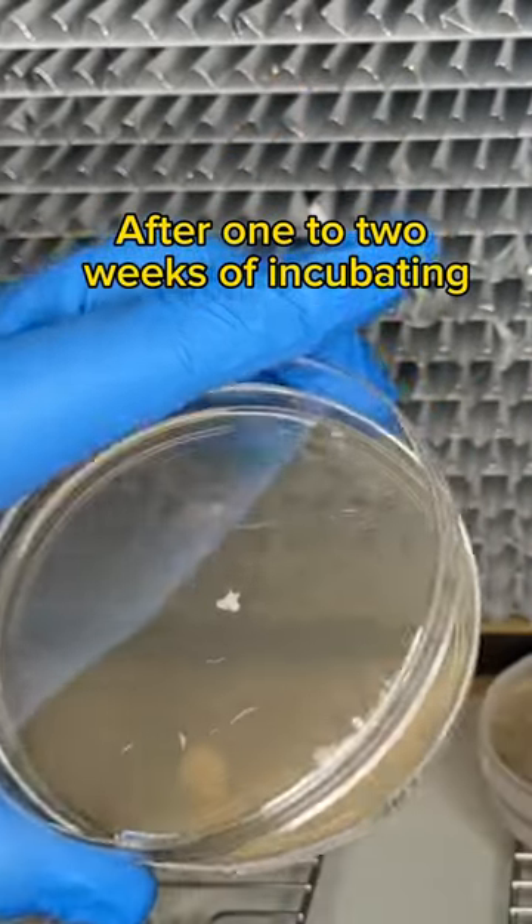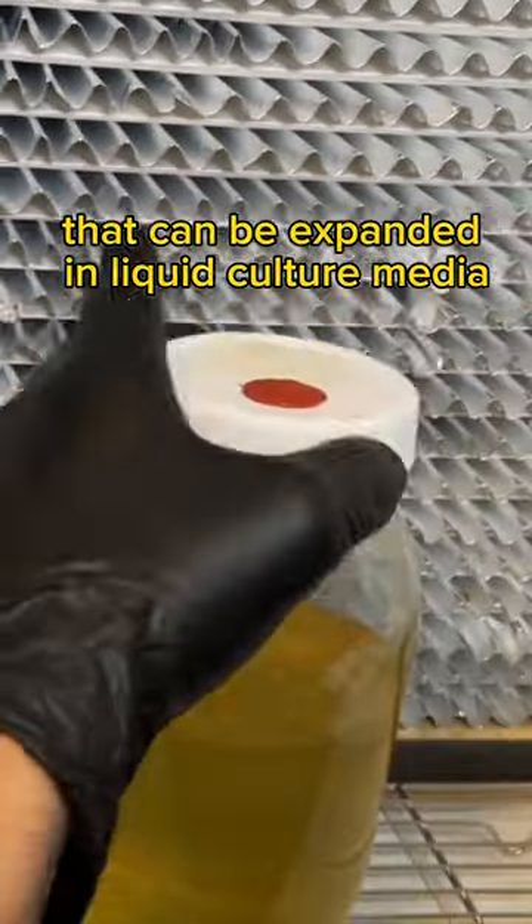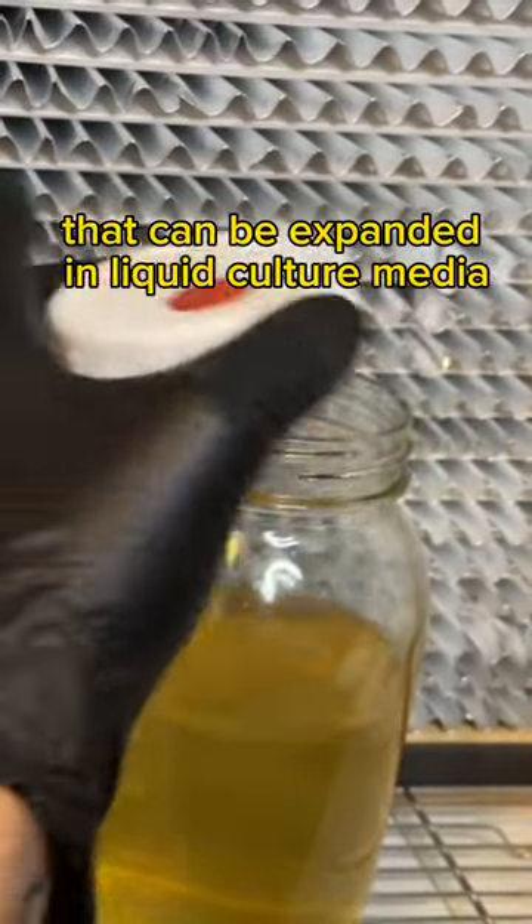After one to two weeks of incubating at 75 degrees Fahrenheit, the agar plate is full of mycelium that can be expanded in liquid culture media.